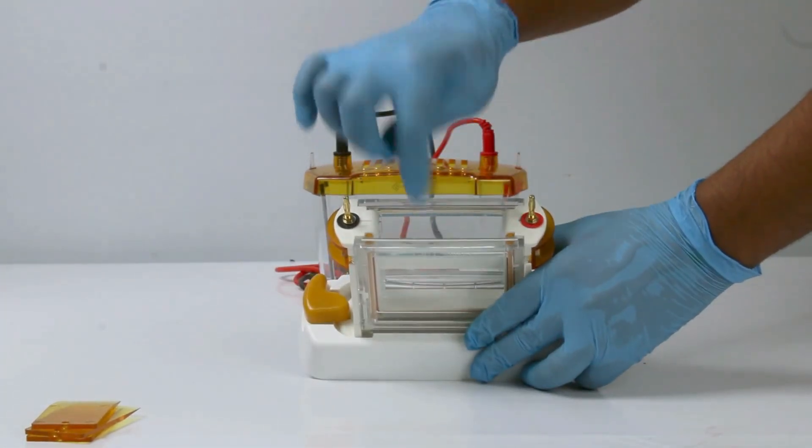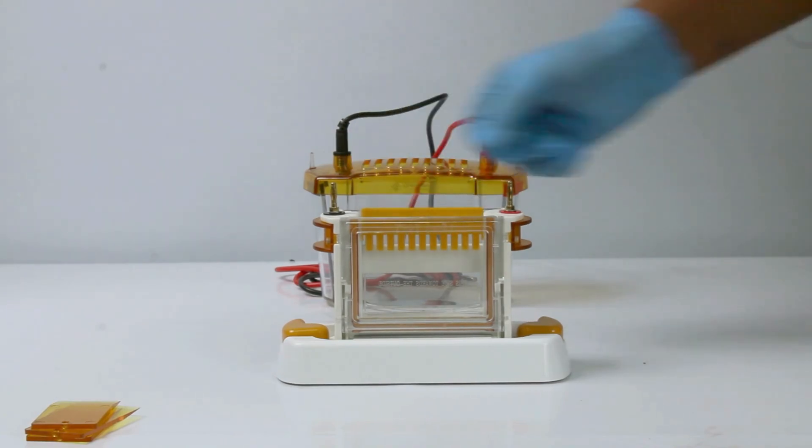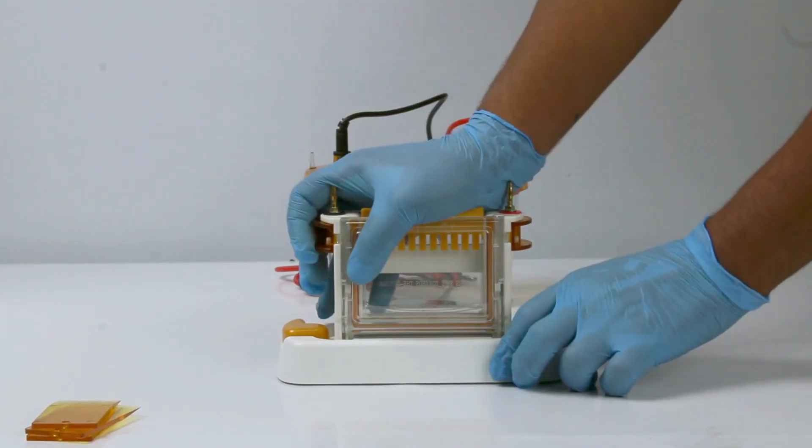Load the gel solution into the chamber between the glass plates as per your experimental protocol. Insert the appropriate comb and allow the gel to polymerize. Once the gel has set, loosen the knob.